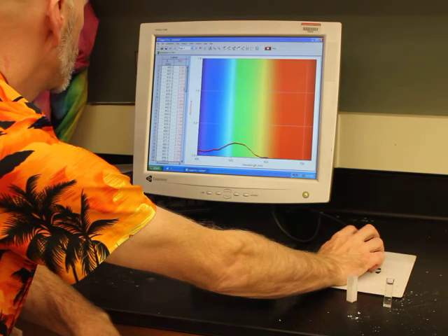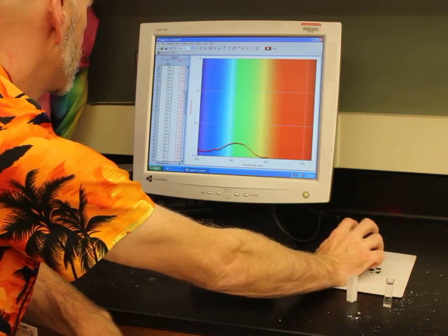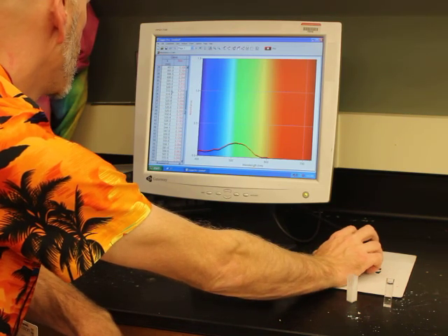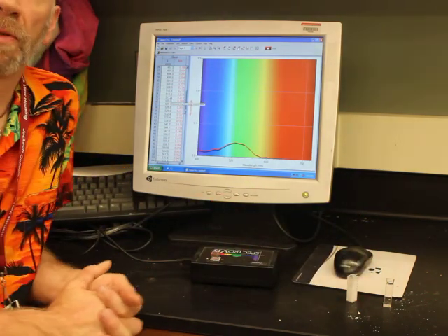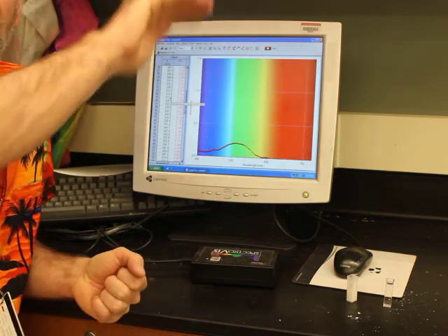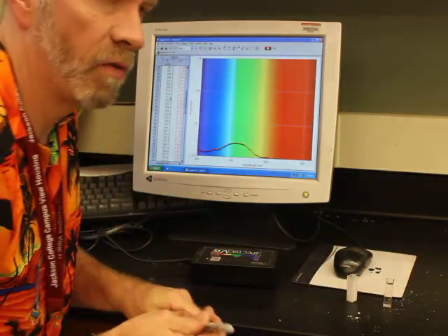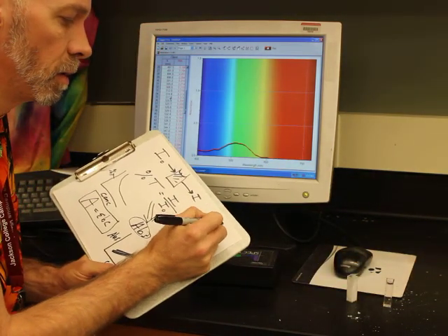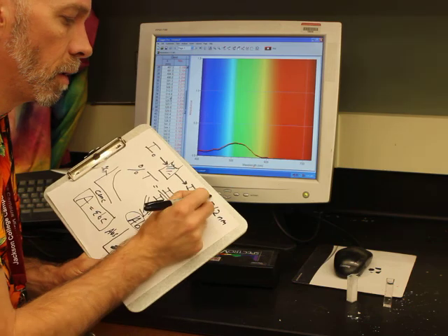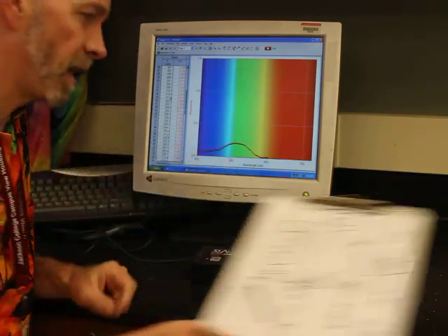So for today, that's why I did it at this wavelength. It looks like our wavelength is about 512 nanometers, right? That is where the absorbance is the highest. So 512 nanometers is what we are going to measure all of our measurements at, right? It's really important that we always take it at 512.